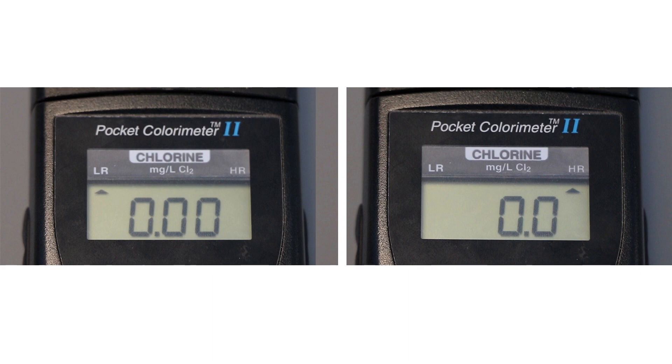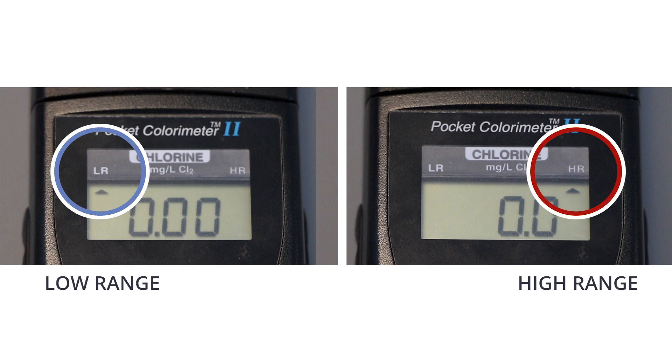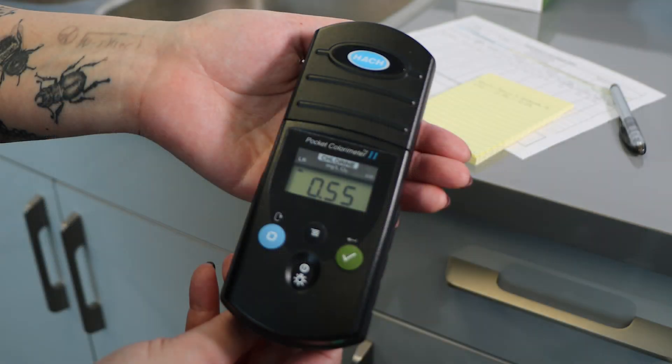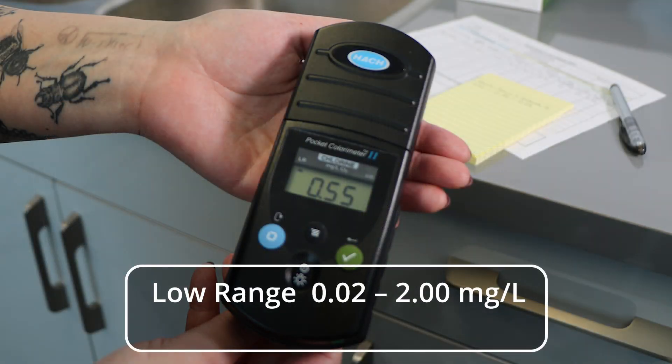A typical pocket chlorometer has two ranges, low and high. Before using the chlorometer you must select the proper range. The low setting reads measurements from 0.02 to 2.00 milligrams per liter of chlorine.